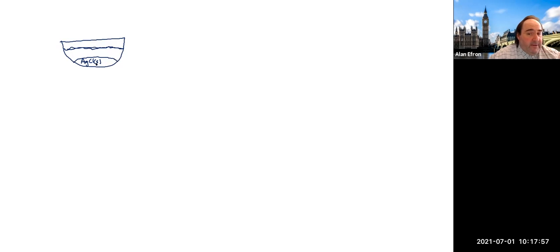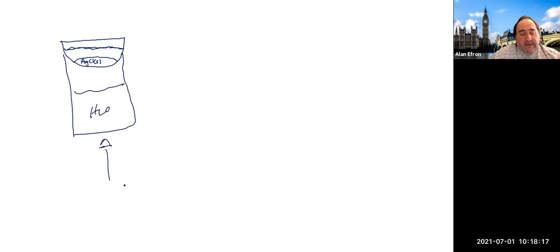So the last part of the process here, after we add those guys together, is we actually are going to put it up on a water bath. We're going to put this evaporating dish on top of a water bath that is going to be heated.